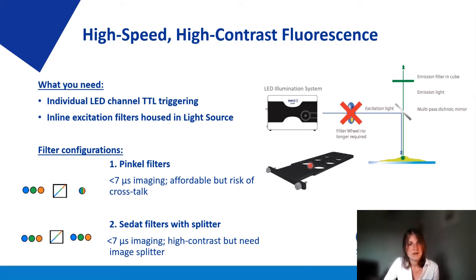And when you're using multiple fluorophores, instead of having a filter wheel, you don't have any mechanical movement, you're just relying on the LED triggering. This can be as fast as sub-7 microseconds. So you're really capitalizing on the speeds available here. However, it still has a multi-band component, so it can risk crosstalk.